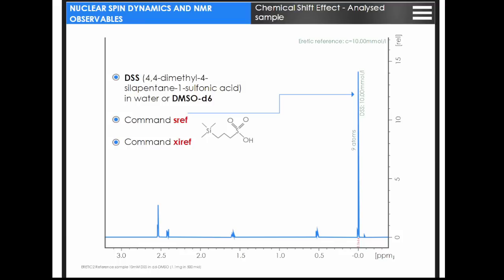The chemical shift effect is important because it fingerprints chemically different populations of nuclei in a sample. That is, the presence of chemically shifted peaks in NMR spectra makes it possible to determine the chemical composition of a sample, as well as to measure the relative amounts of nuclei present in different chemical environments.